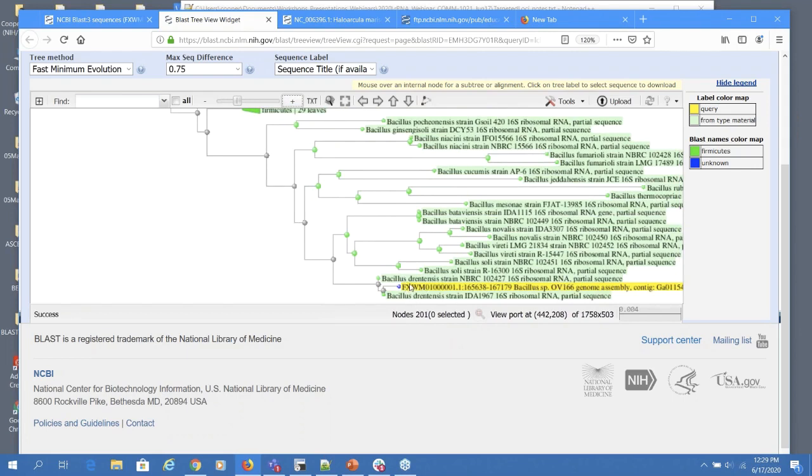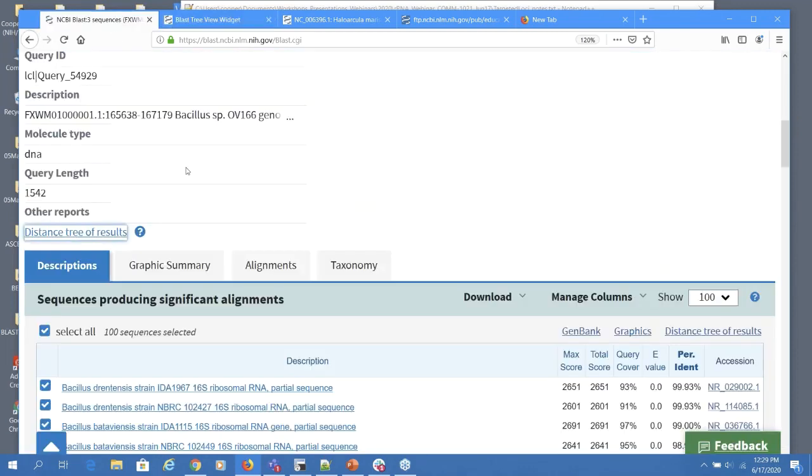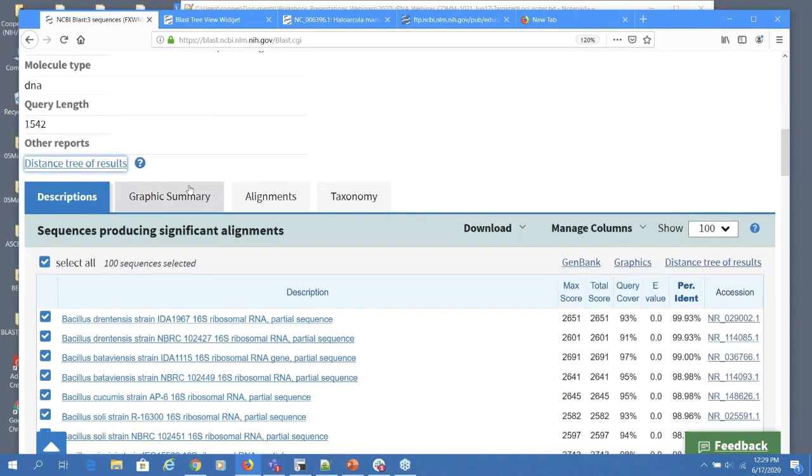And so now, do I know that that's the species that it is? I don't know for sure. I've got it certainly within, it's close to that particular species. And I won't go through the other ones. It's pretty much exactly the same exercise.